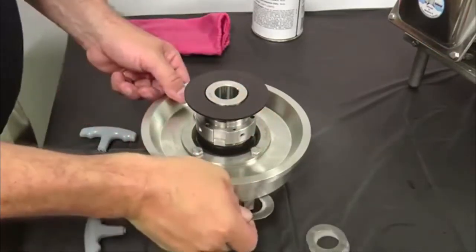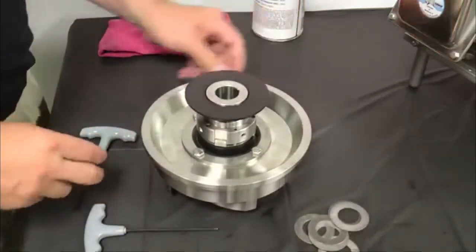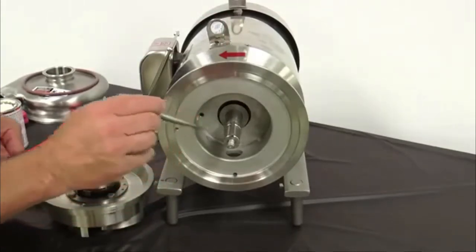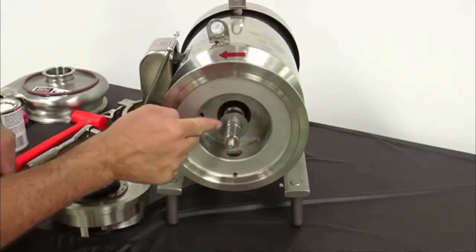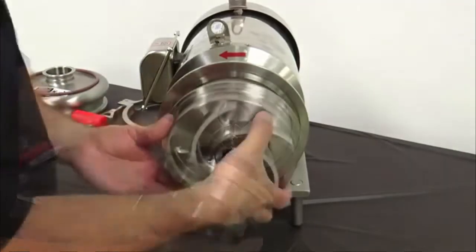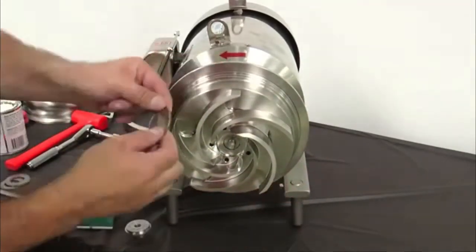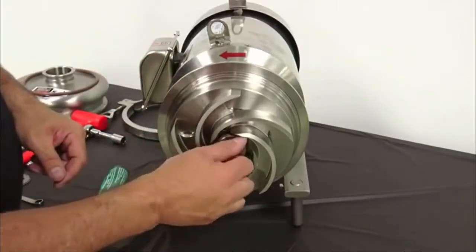Remove the shims located between the impeller and back plate. Apply anti-seize compound to the motor shaft and install the key. Ensure the same number of shims are installed on the shaft as there were when the pump was disassembled. Upon aligning the keyway, install the impeller assembly onto the stub shaft. Lubricate and install a new O-ring on the impeller retaining bolt and thread onto the shaft.